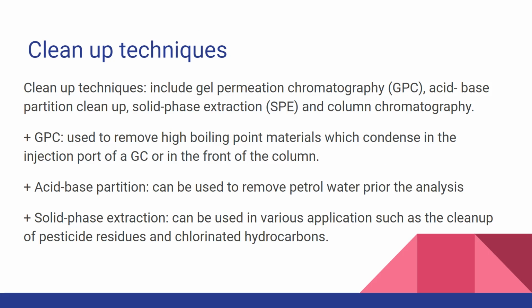Cleanup techniques include gel permeation chromatography, acid-base partition cleanup, solid phase extraction, and column chromatography. GPC is used to remove high boiling point materials which condense in the injection port of the GC or in front of the column.